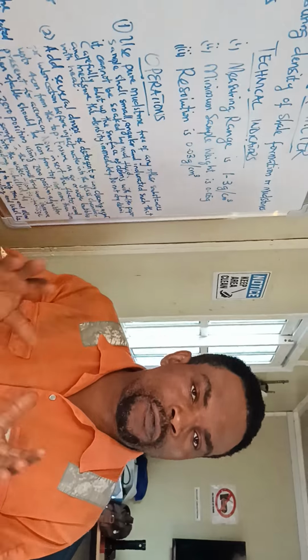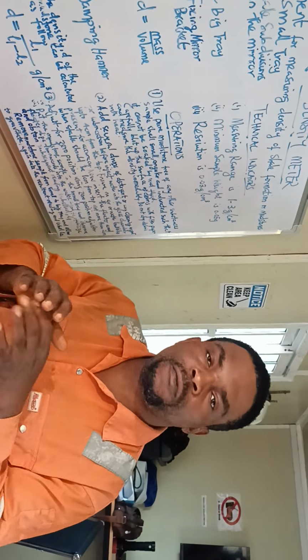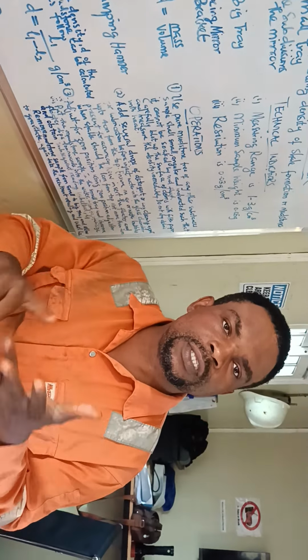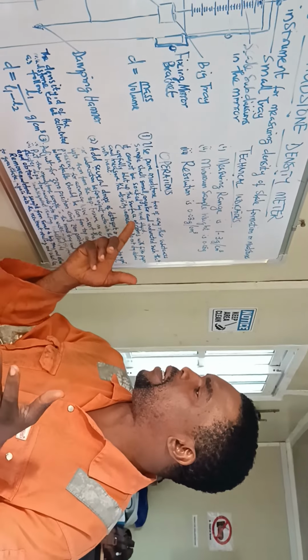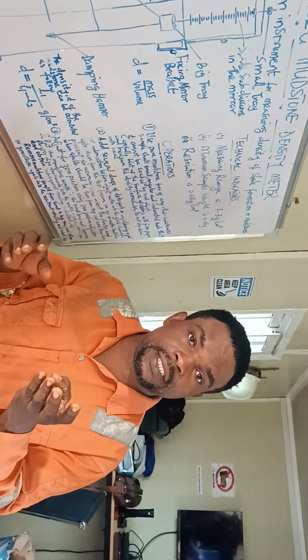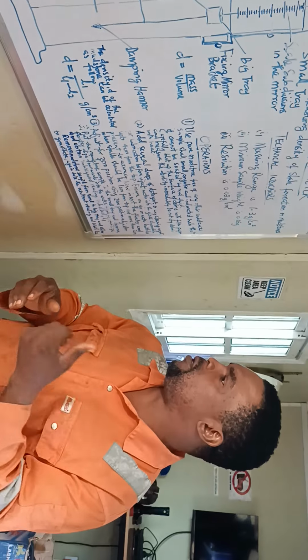Operations. For this measurement, we use pure mudstone, free of any other substances, free from sandstone, sand, limestone, and any other debris. You have to be free from it. Then you ensure that the sample is angular and also indurated. That means it does not wet. It's very solid, so it's competent enough.